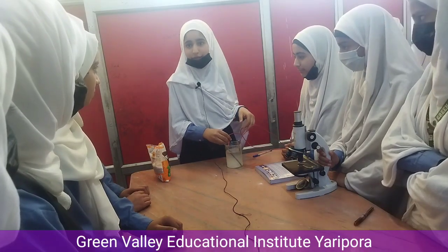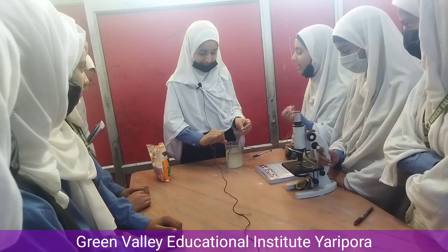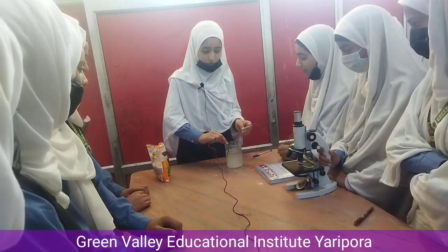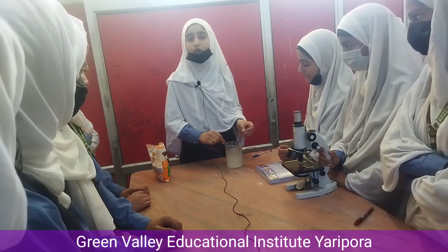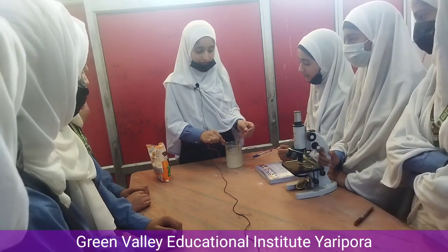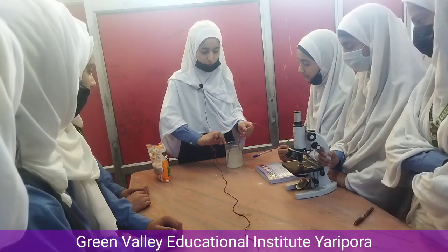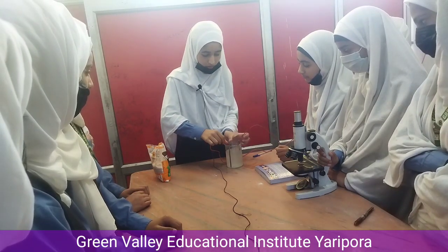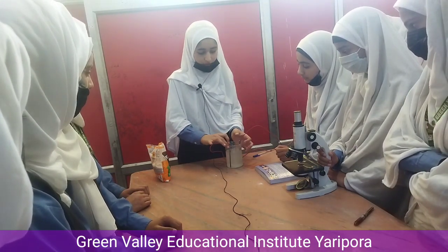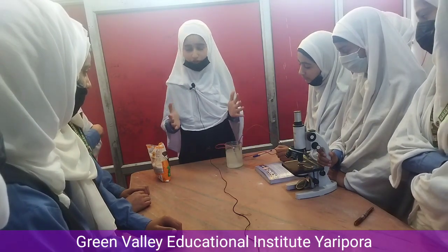Anybody knows what's an electrode? Yes. 2 solid connectors through which a current enters or leaves. Yeah. So these electrodes are the solid conducting materials through which electric current enters or leaves the conducting liquid. So now we have immersed these 2 electrodes in this solution. So now we will pass the electric current through this solution and we will observe something very interesting.